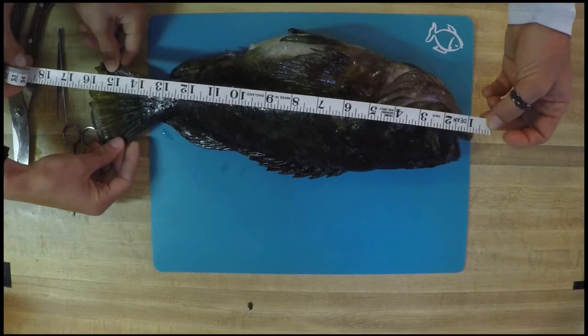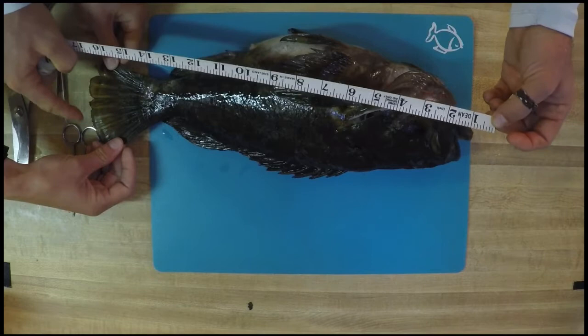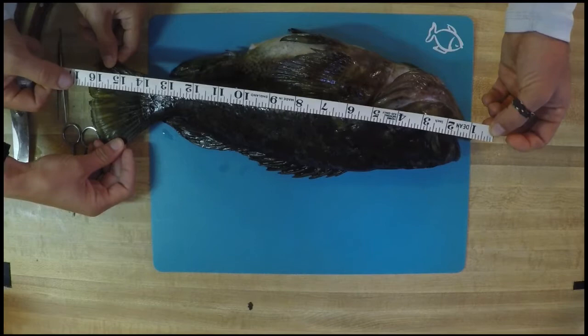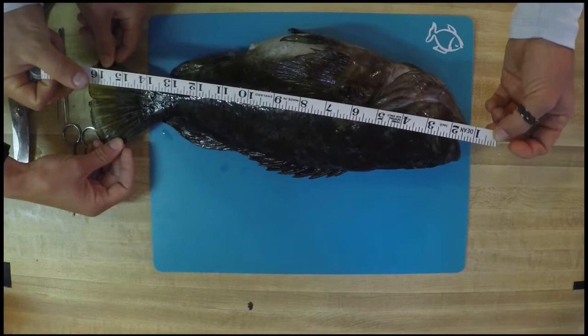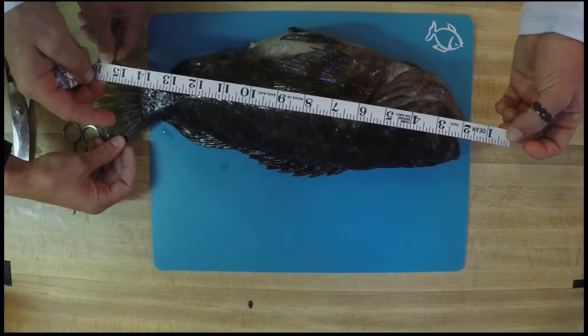Our next type of measurement is called a forked length. That means you're measuring from the tip of the fish's head to the caudal fin. Some fish will have a V in that forked area, and with the forked measurement you measure to that fork. Because we don't have one, that would be a measurement we'd skip on this fish. Our third and final measurement is known as the standard length — it goes from the very tip of the head right to the very last vertebrae of that fish. This one is right around 13 and a half inches.